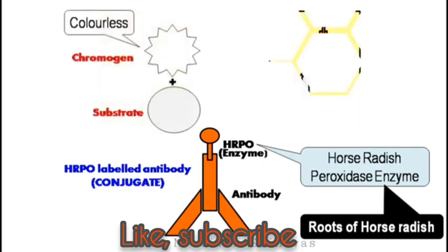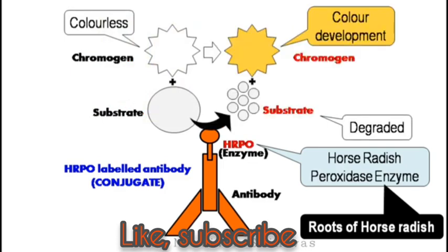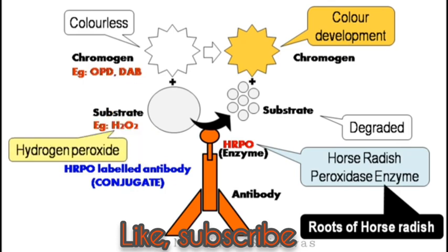Subsequently, on addition of substrate plus chromogen, due to the catalytic reaction mediated by this HRPO enzyme, the colorless chromogen turns to color. In this technique, orthophenylenediamine, OPD, or diaminobenzidine, DAB, are used as chromogen, along with hydrogen peroxide as substrate for the HRPO enzyme.